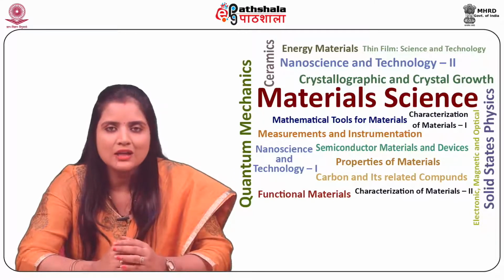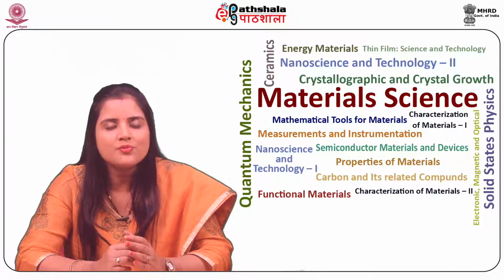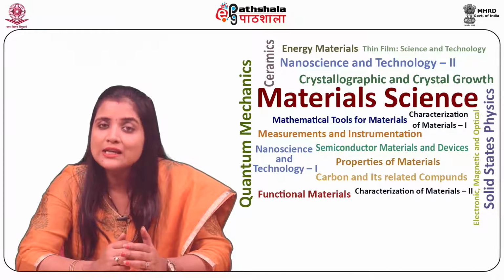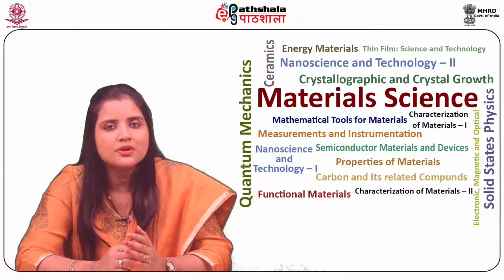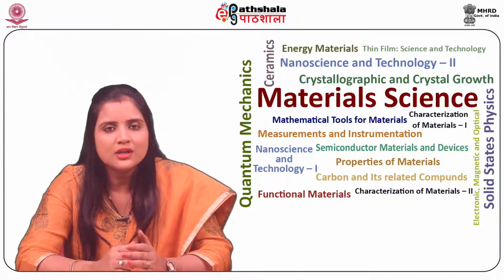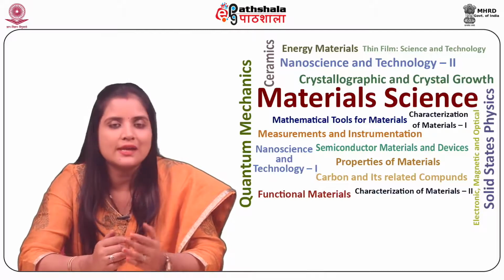Energy dispersive analysis of X-rays, also known as energy dispersive spectroscopy, can also be abbreviated as EDS, EDX, EDXS, or XEDS. Sometimes it is termed as energy dispersive X-ray microanalysis, that is EDXMA, or energy dispersive X-ray analysis, which is EDXA.